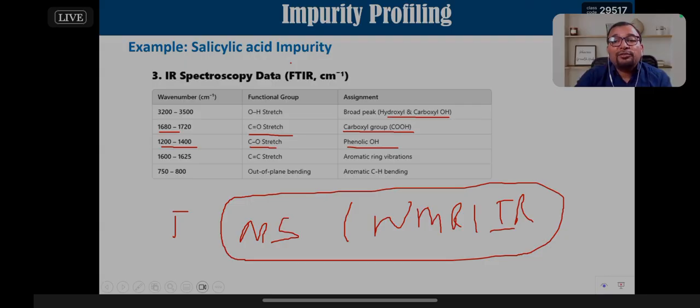Yes, I tried my best to explain the forced degradation studies, peak purity. We talked about impurity profiling part. We talked about interpretation of the major analytical tools.